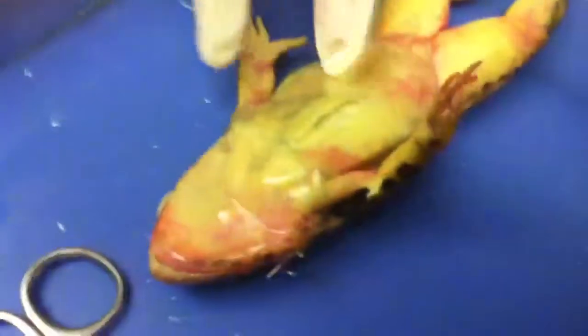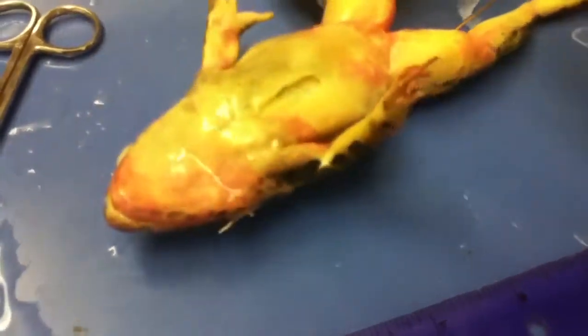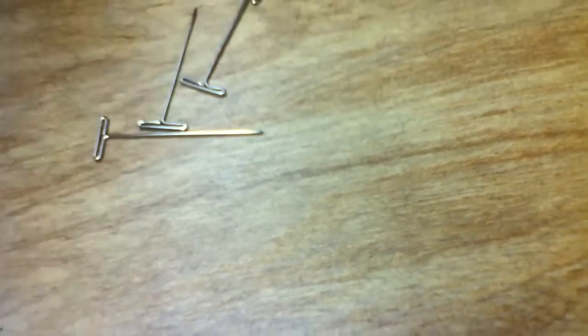Wait, let's see. Let me read the next instruction. Look for the opening to the frog's cloaca, located between the hind legs. Use the forceps to lift the skin, and use the scissors to cut along. Okay, I think you have to pin it down now. Okay. Hand me 4 pins, please. You should have gloves. Oh, these pins are clean. Oh, okay. That's why I'm having her hand them to me. Oh yeah, you can just get it. Pin?